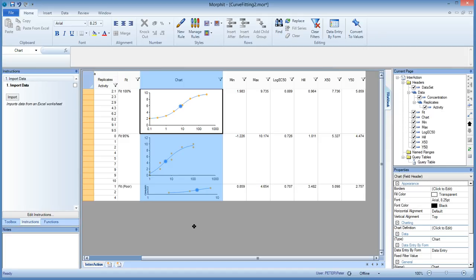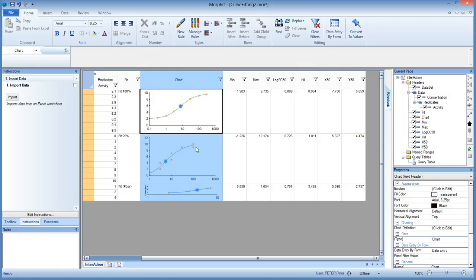And this is great, of course, for interaction with your data, because you can now judge for yourself if the EC50 lies in the range that you were measuring. So it can easily happen in some of your data, of course, that your EC50 lies outside of the curve. So for instance, here, and that is a range that you didn't measure. And then that might be reason for you to reject the whole parameter extraction or the whole fit.